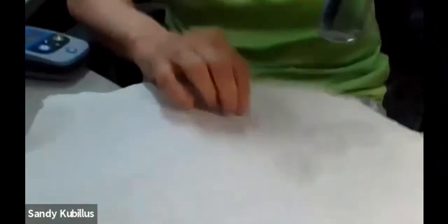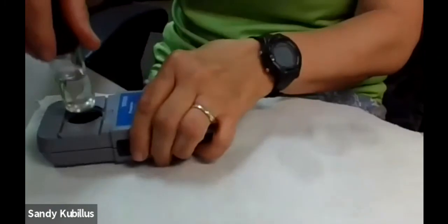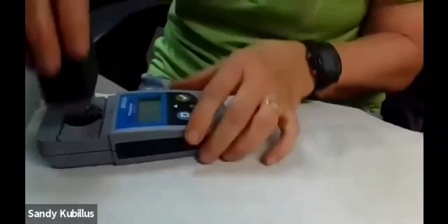But then with phosphorus and also nitrogen, we have a little pocket colorimeter. And so here we had a base sample and a phosphorus sample that was from the Des Plaines River. Let me show you this. You can see this is quite blue, while this one is pretty clear. And so what I would do is put this in here and put the cover on it.